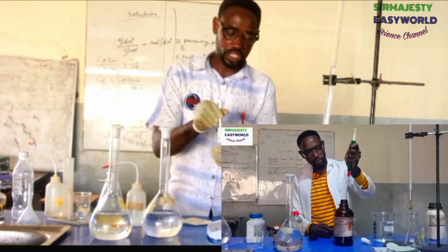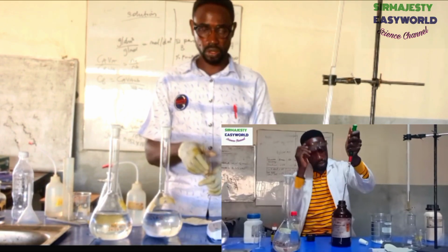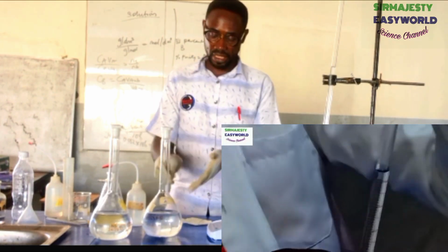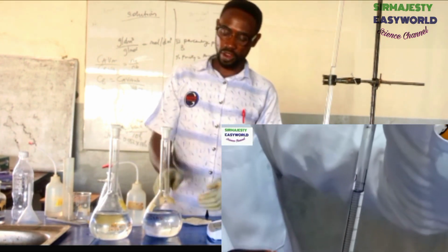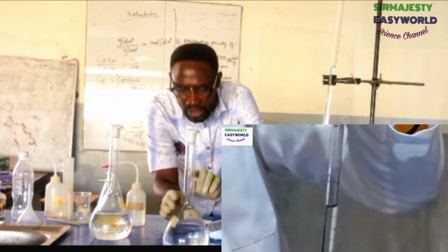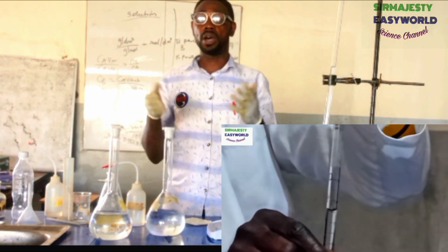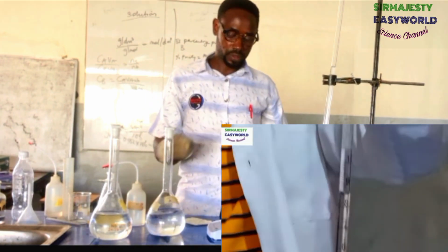For A, measure 6.3. Then to make it easier, you can use what you are seeing on the screen. You can use the pipette pump and the graduated pipette. It makes it easier instead of using this one, which might be difficult. Then when you add already measured 6.30 ml on this, you now add up to the mark. There is a mark here. That's 1000. You add it up with water. This one has been prepared and already used. So you fill it in that mark and keep for at least 3 hours before you do your titration. So that's for your solution A.